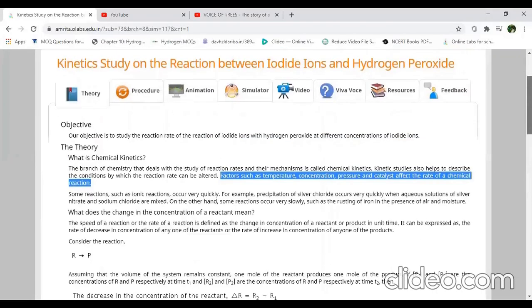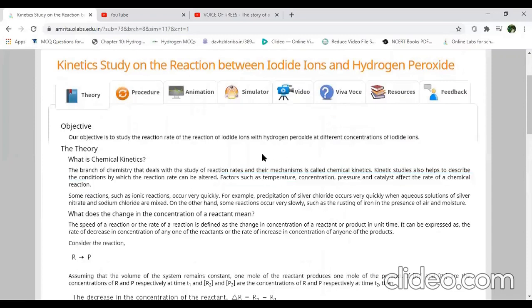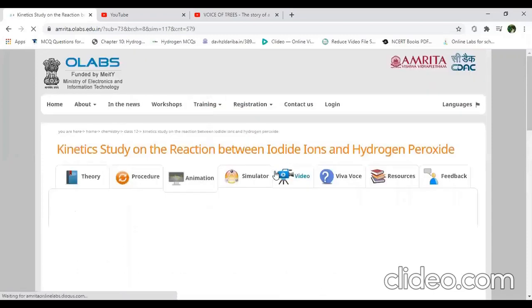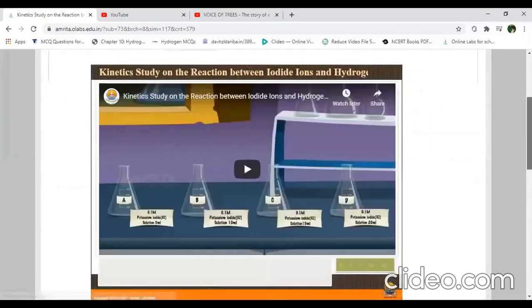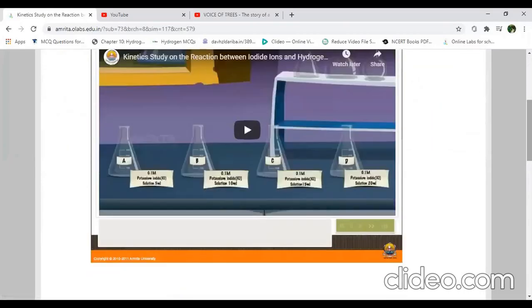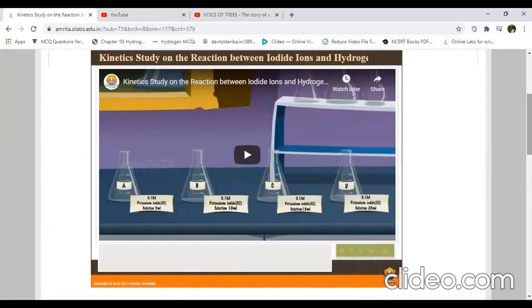First I'll show you the procedure — try to observe it carefully and afterwards we'll understand what is happening. Today we are going to learn about the kinetic study on the reaction between iodide ions and hydrogen peroxide. I hope everyone has their notes and is following along with this video.